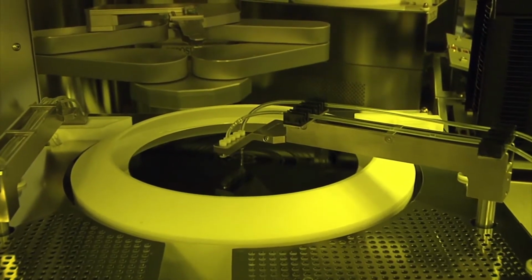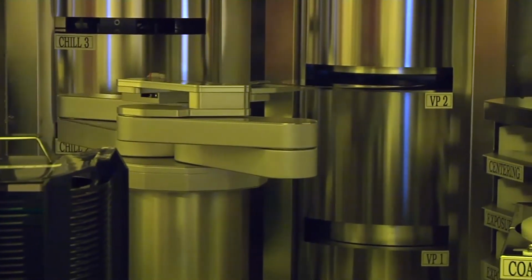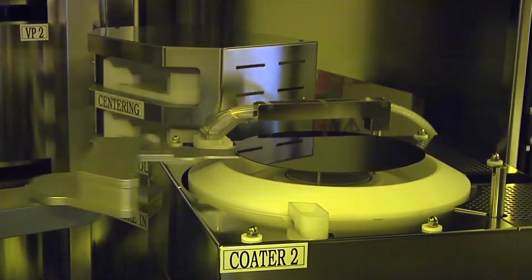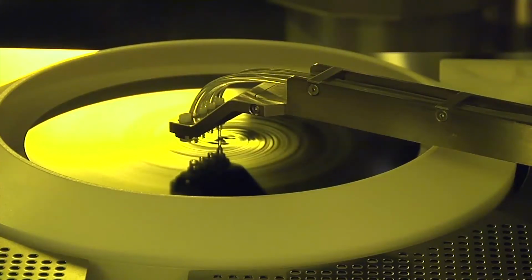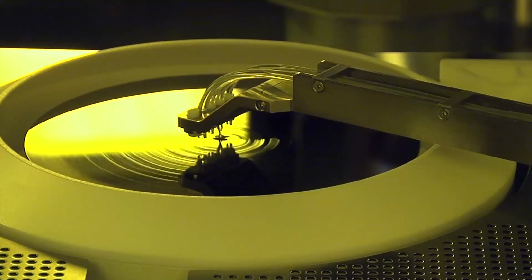Activated wafers are coated with a monomer solution and transferred to a reaction chamber for coupling. Excess reagent is washed away to leave a single molecular layer of permanently linked amino acid. Photolithography is employed to pattern the wafer such that only predetermined locations will participate in the subsequent coupling event.